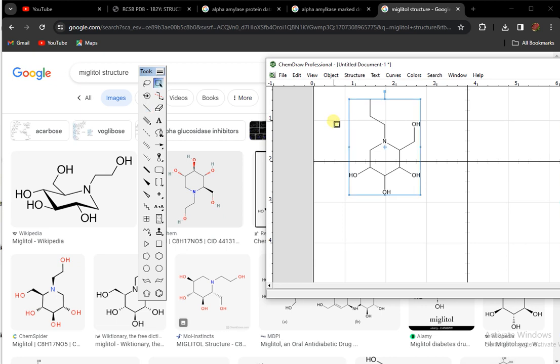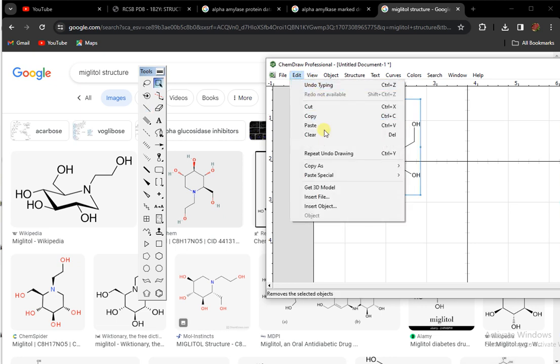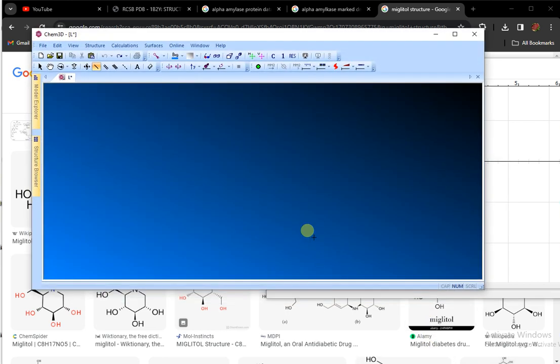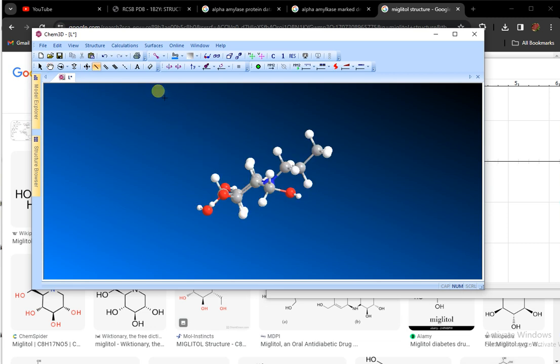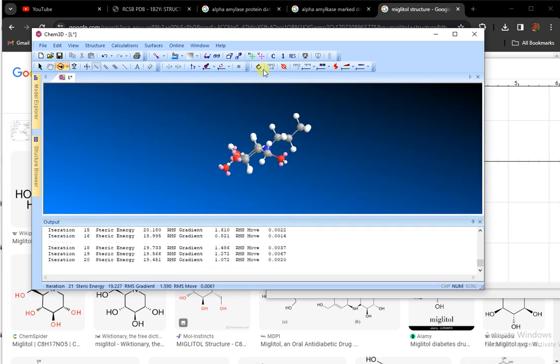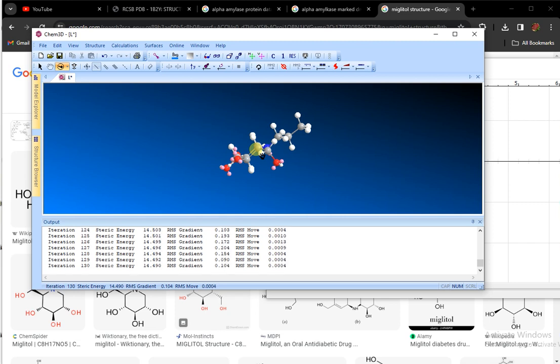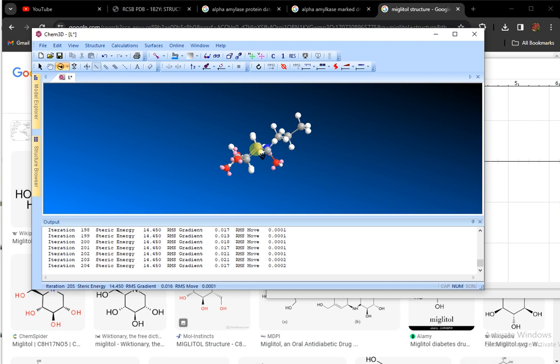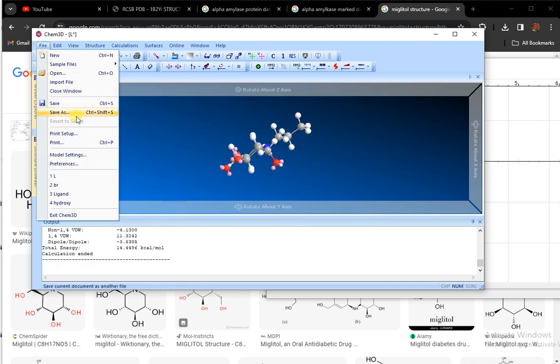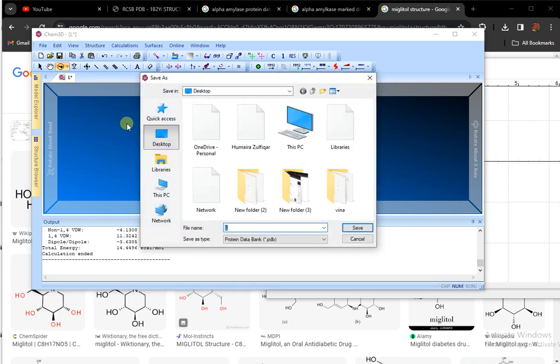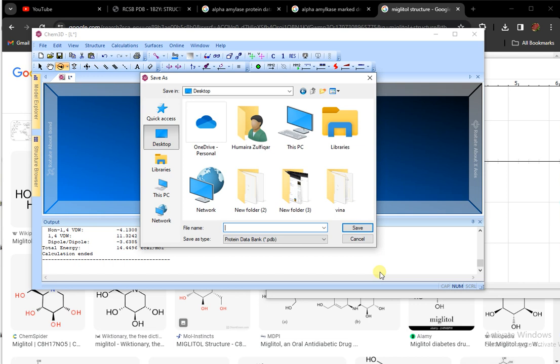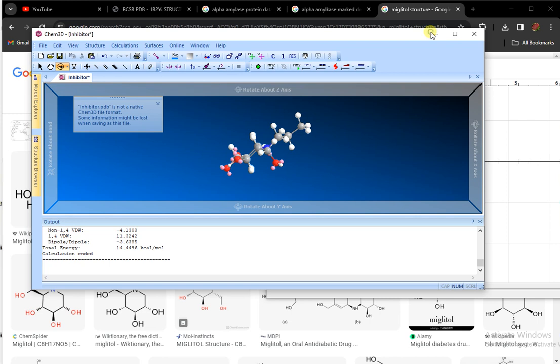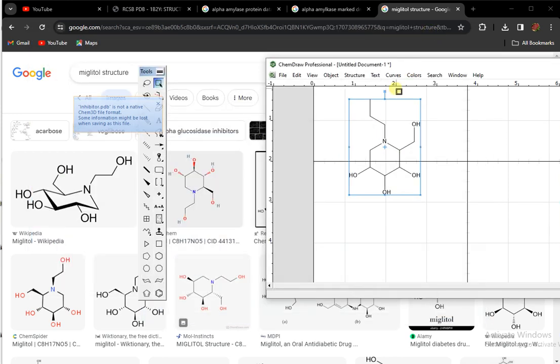I copy the structure, edit, copy as SMILES. Now I open Chem3D and paste the structure in Chem3D. Here I go to MM2 to minimize energy of that inhibitor. If marketed drugs are available, then those are much better than inhibitors as a standard. It will take some seconds or some minutes. It is done. I simply save it to desktop; I give this name 'inhibitor' and keep in mind to save it in PDB format.